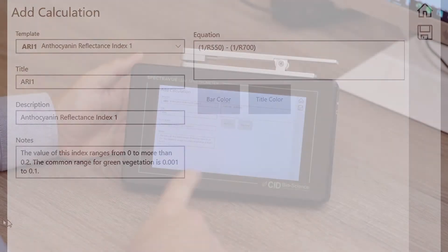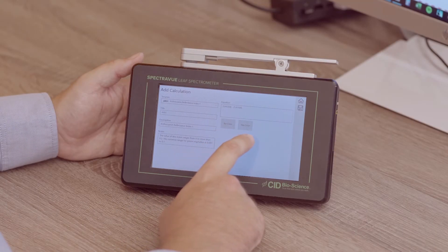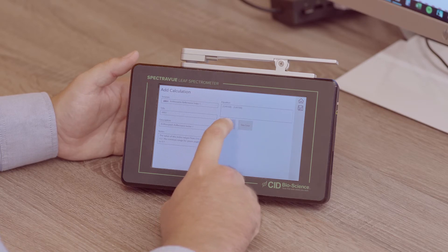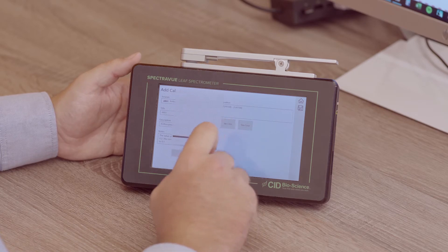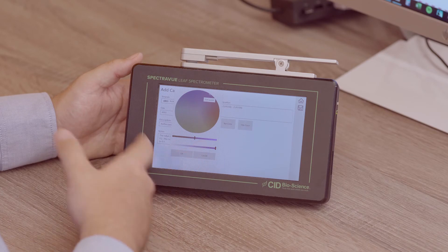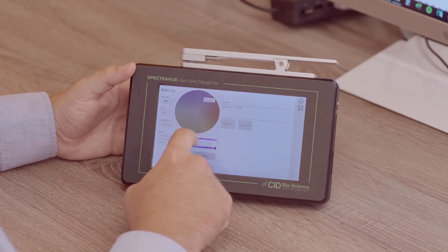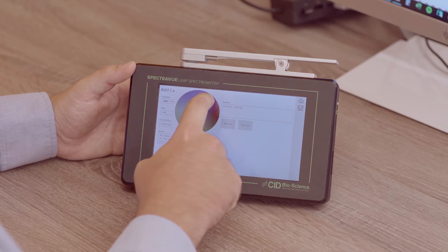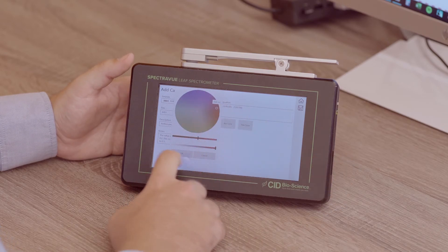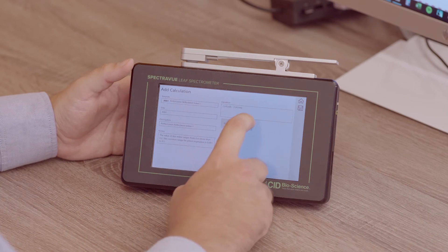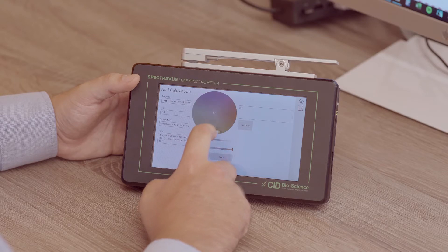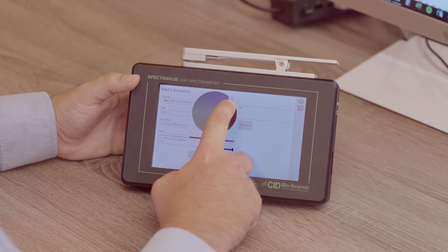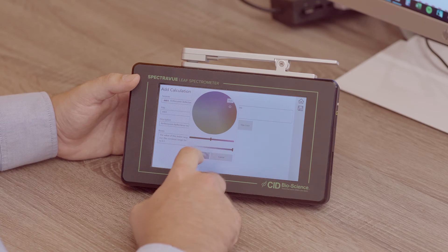Then you'll see two other options here for this index, and that's to change the bar color, which is going to be the color of the bar on the graph on the bottom of the home screen. This brings up a color wheel you can customize to whatever color you want. It's anthocyanin, so I'm going to change it here to be reddish dark red. And then we can also change the title color, which just changes the text on the bottom that says ARI1.